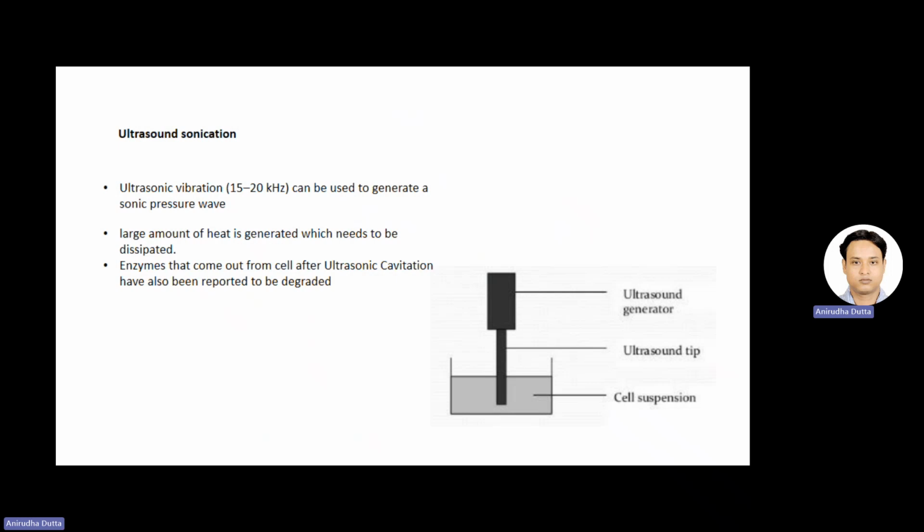Second, while sonicating, it generates a huge amount of heat, so you have to keep the sample in very ice cold condition so that the heat gets dissipated. Otherwise, the heating would denature the protein sample.